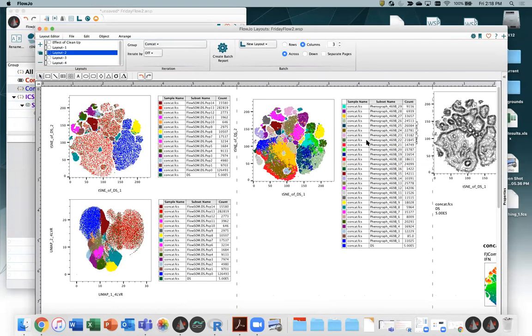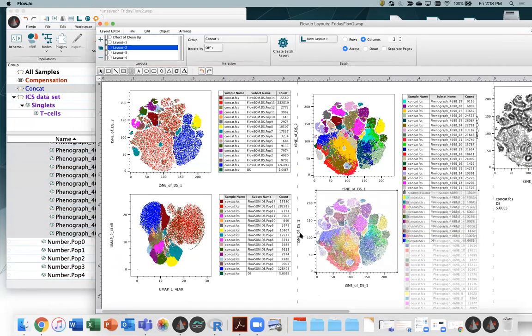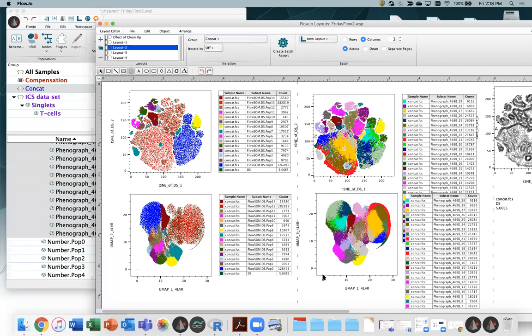And then we could also duplicate this plot, just holding down Option, and show these on the UMAP. On the UMAP scale, and give you a feel for that. And so that actually looks on the UMAP scale. That's pretty interesting, isn't it? That the Phenograph populations are really nicely, tightly lumped together, again, indicating that perhaps UMAP is doing a bit of a more accurate job, even if it doesn't look particularly nice. That everything Phenograph said was a cluster just sticks together, as opposed to being a little bit more intermixed and spread out.